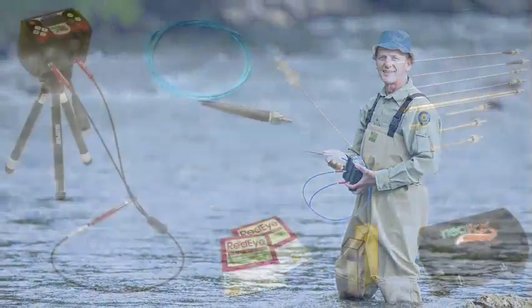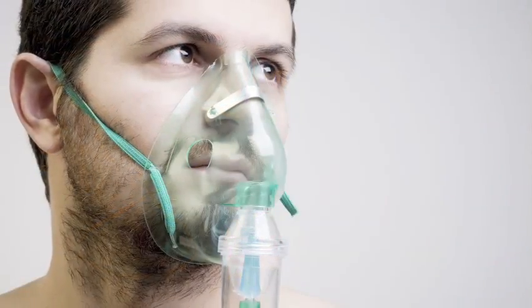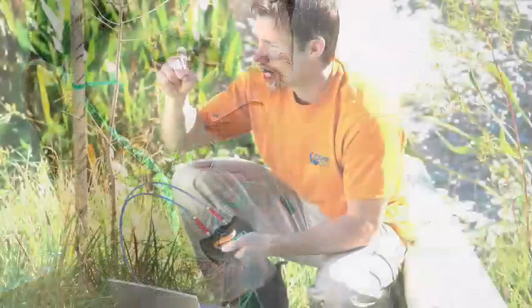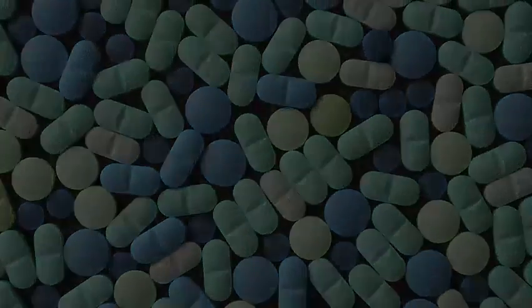OceanOptics optical oxygen and pH sensors are ideal for medical and life sciences, environmental monitoring, food and beverage packaging, pharmaceutical production, and so much more.